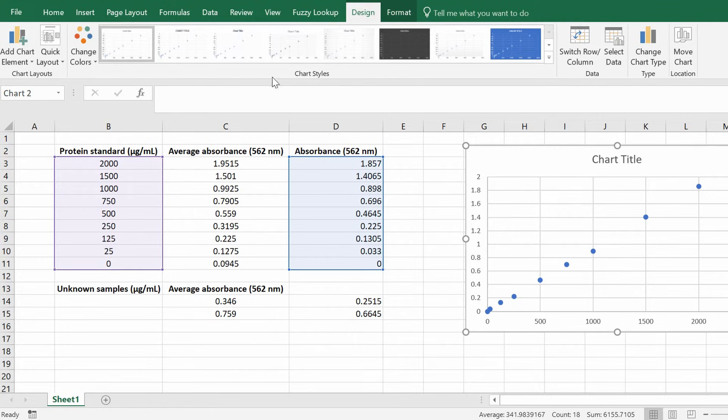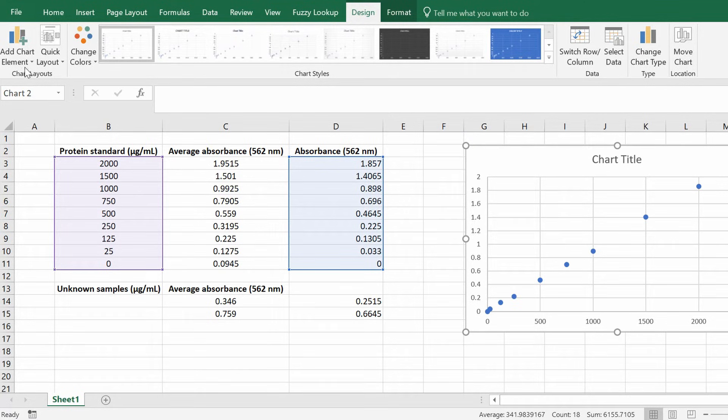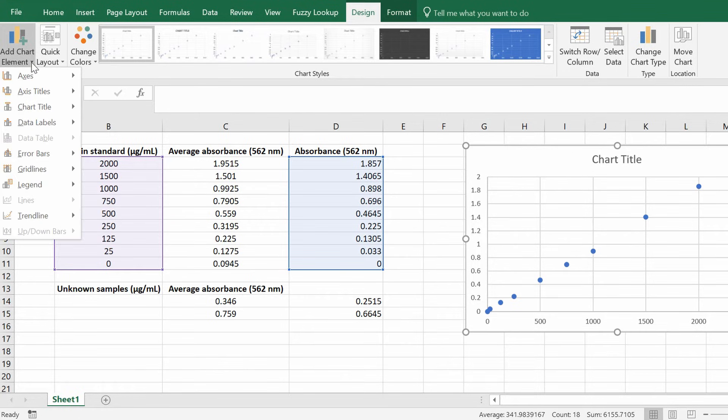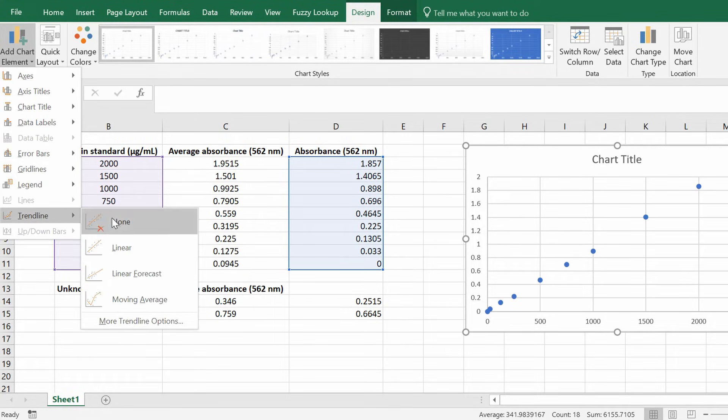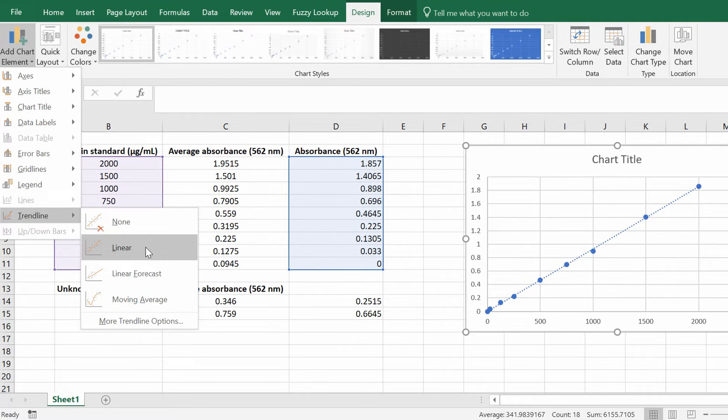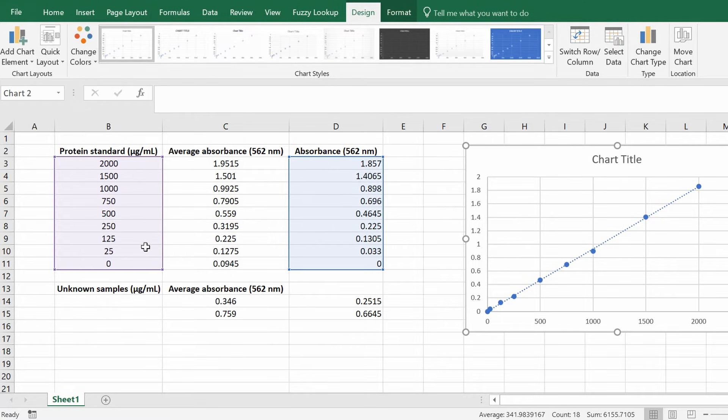Now to insert a line of best fit you want to go on to the design tab on the left. It says add chart element. You want to click this, scroll down to see trend line and then you want to insert a linear trend line. So click this. So that looks a lot better. It's quite linear.